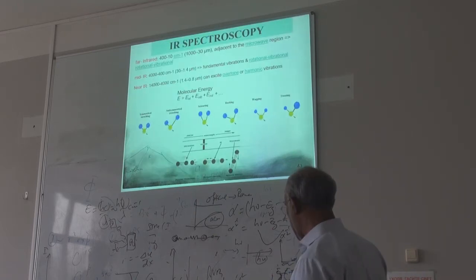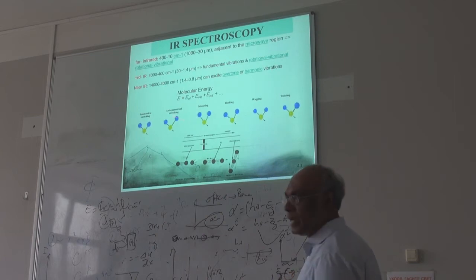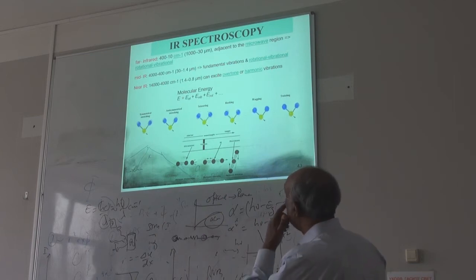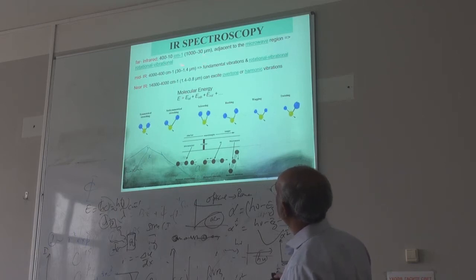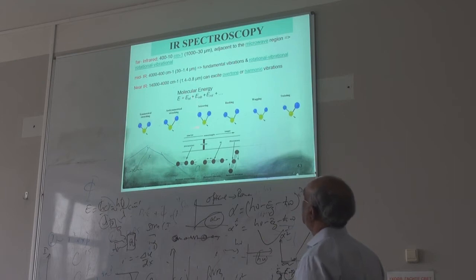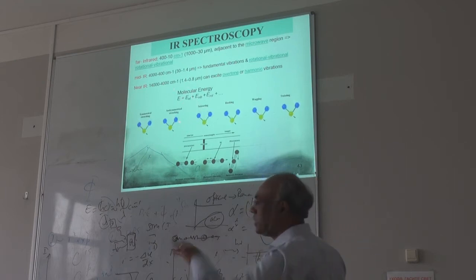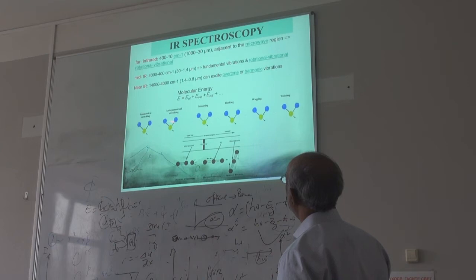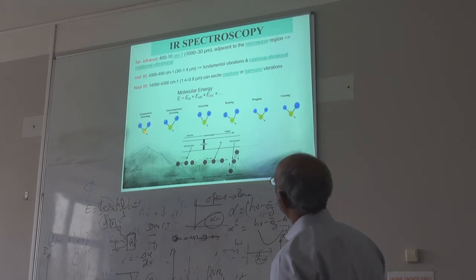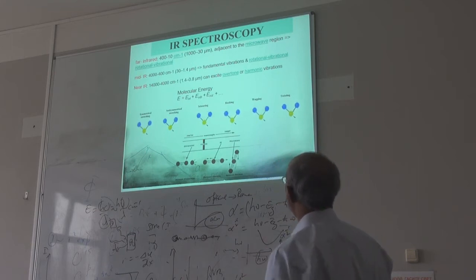Okay, so the last thing is IR spectroscopy, infrared. These are mostly looking at features in the infrared range, going to your micrometer scale, right? So they are mostly looking at vibrations, electronic transitions, vibrational and rotational, all these things. So you can see some of the IR vibrations. You can have symmetrical and asymmetrical, we call the scissor mode, rocking mode.